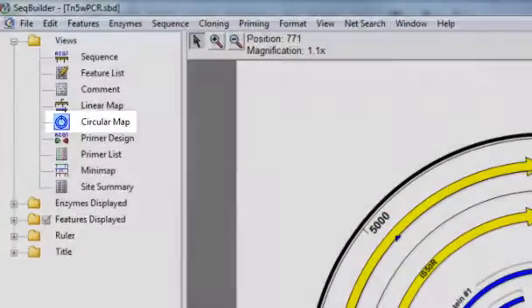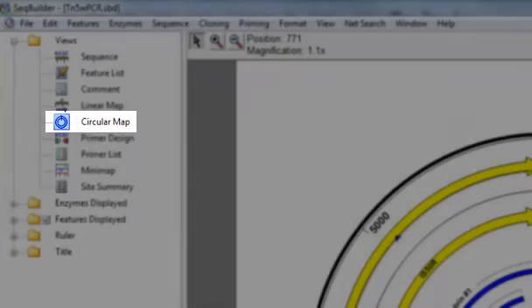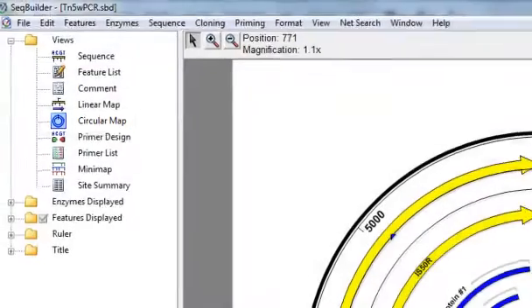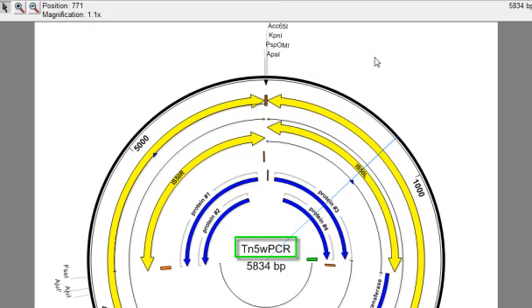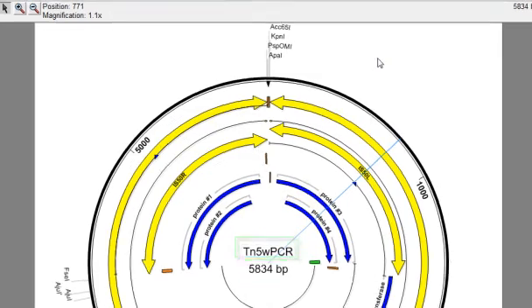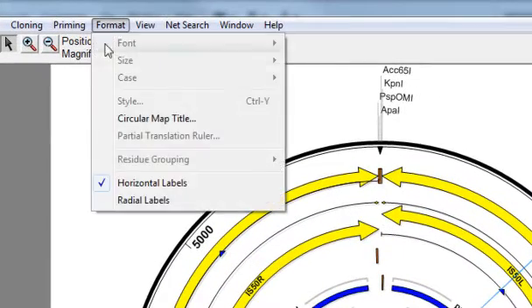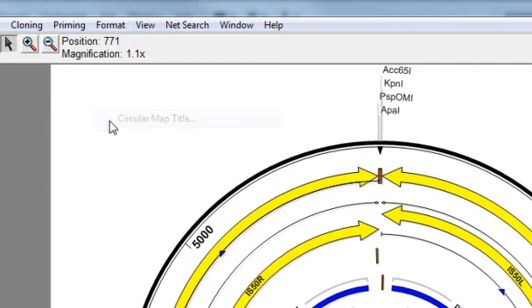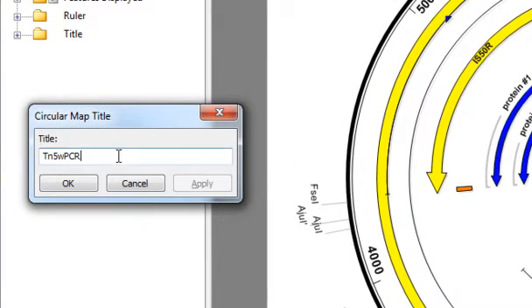The circular map view displays a circular map of your nucleotide sequence. From here you can display enzymes and features against the circular ruler that represents your sequence. By default, the title of the map comes from your sequence name, but you can change that just by selecting Format, Circular Map Title, and then you can change it here.